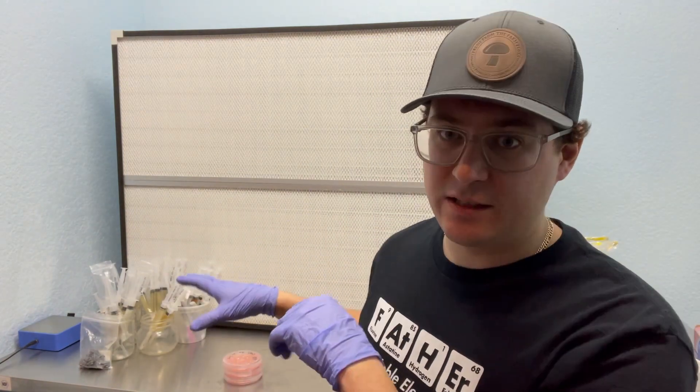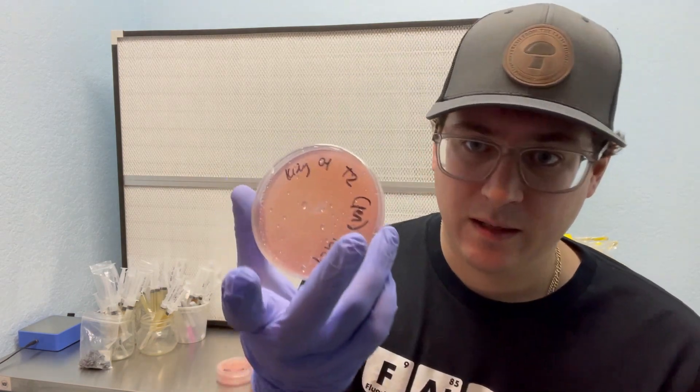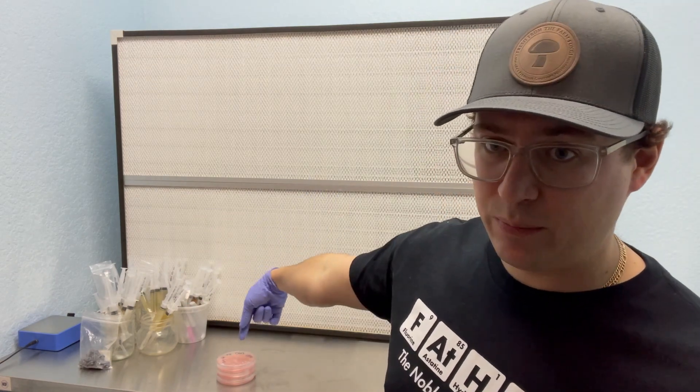There's a few more complicated techniques that you can use, such as using different medias like antibiotic media. But I like to steer away from that and use my skills with aseptic technique. And using my lab properly in order to save these cultures on a petri dish plate, which is like ten cents. So it really makes it worthwhile to have the skill set to be able to continue your cultures perpetually for the most part. If you're interested in getting some of our liquid cultures and possibly some plate cultures this spring, I'm going to have all new varieties on our Etsy.